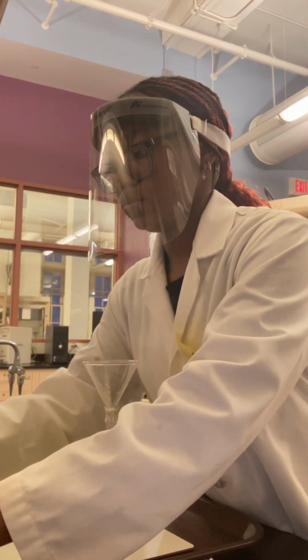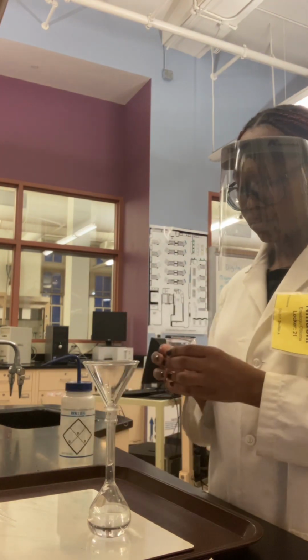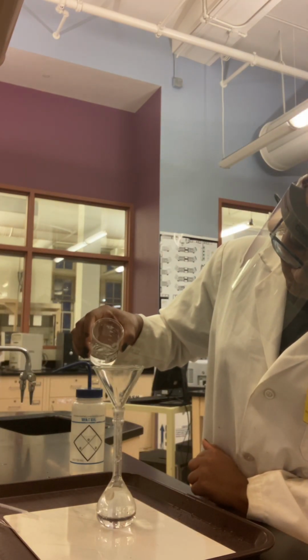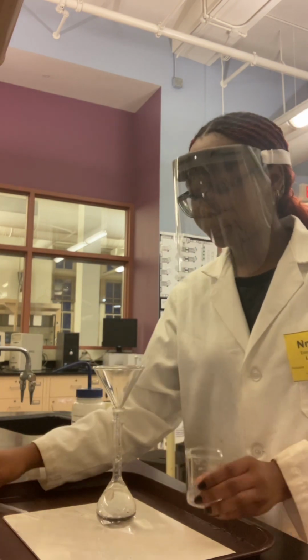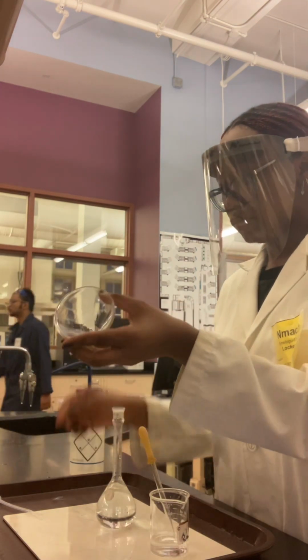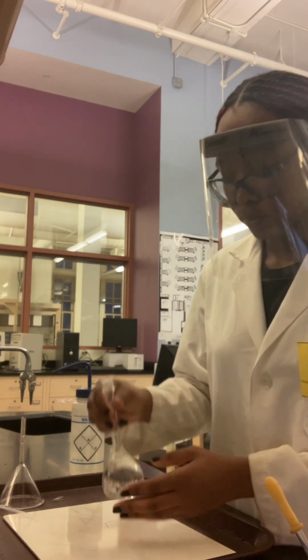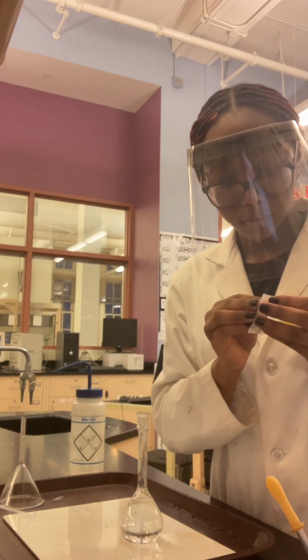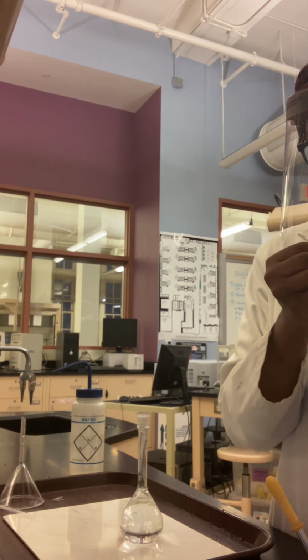So I will continue to transfer the salt solution into the volumetric flask through the funnel until it's partially filled. So this is the result of my volumetric flask being partially filled. And now I'll use my parafilm to cover the top of the volumetric flask securely.